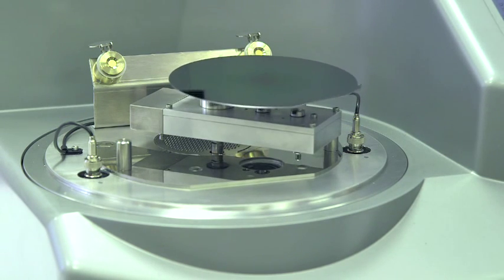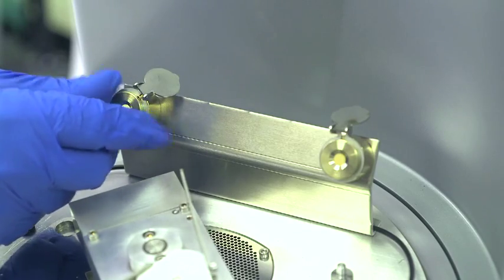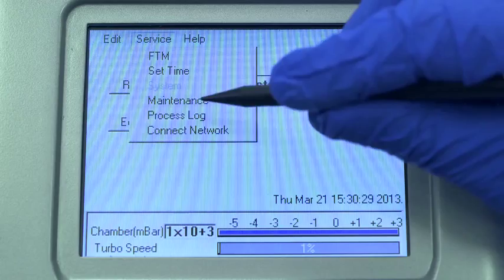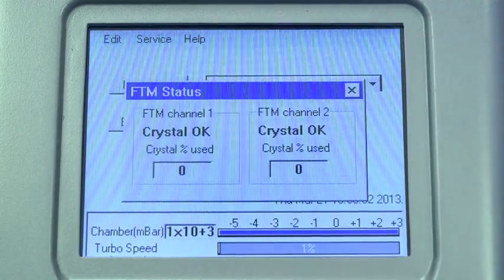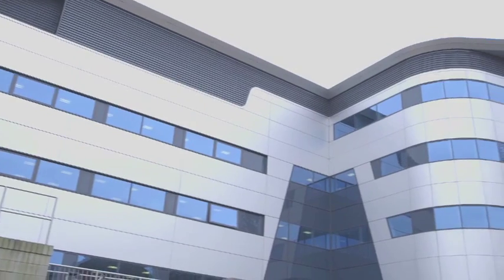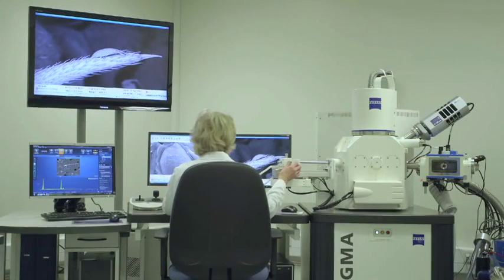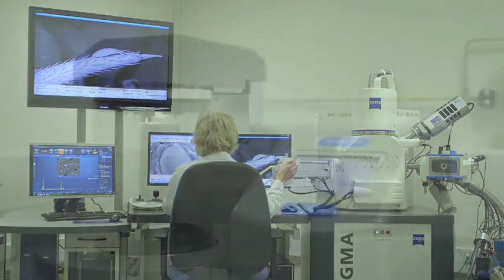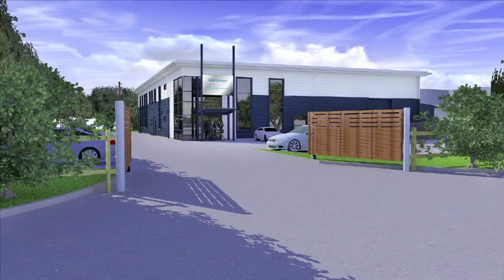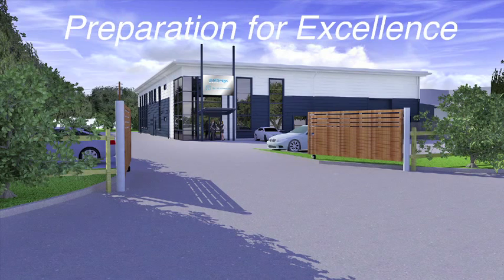The system can be pre-programmed for deposition of up to five sequential coating cycles, and the thickness of each layer can be controlled and terminated with a dual-channel film thickness monitor. Q-series coaters are already used by over 1,000 customers. Let Quorum Technologies show you how the Q-series can give you the best results and improve your image.